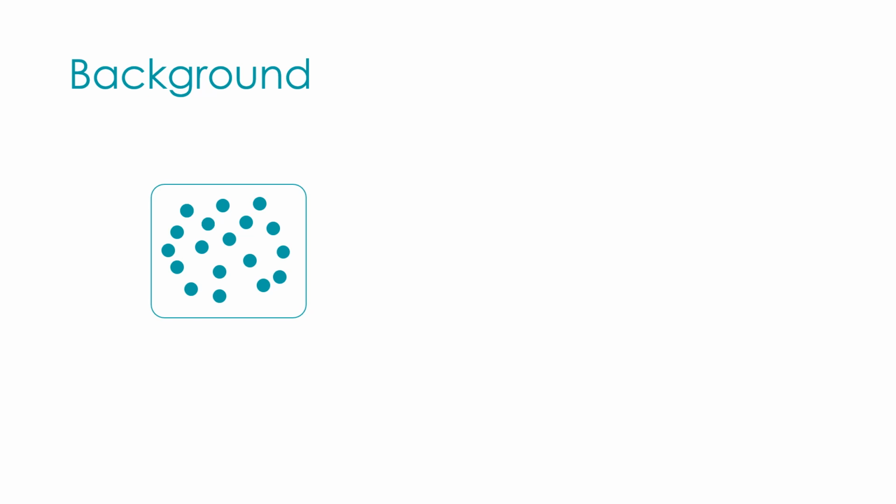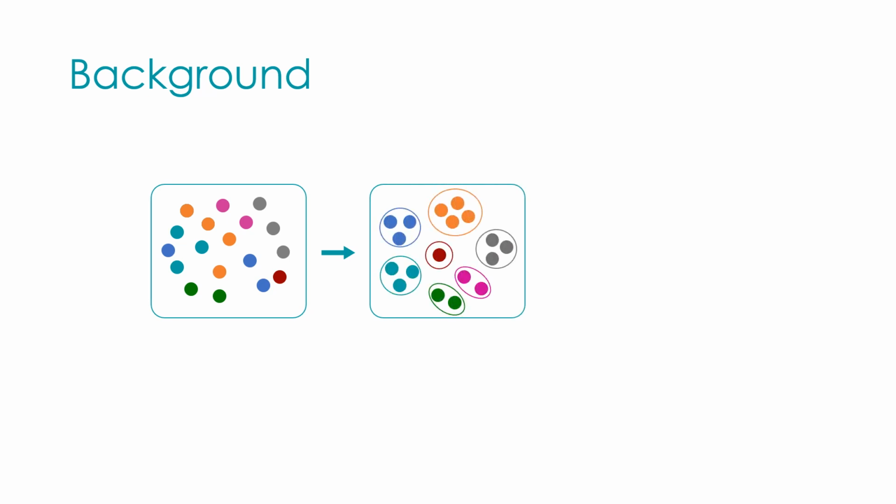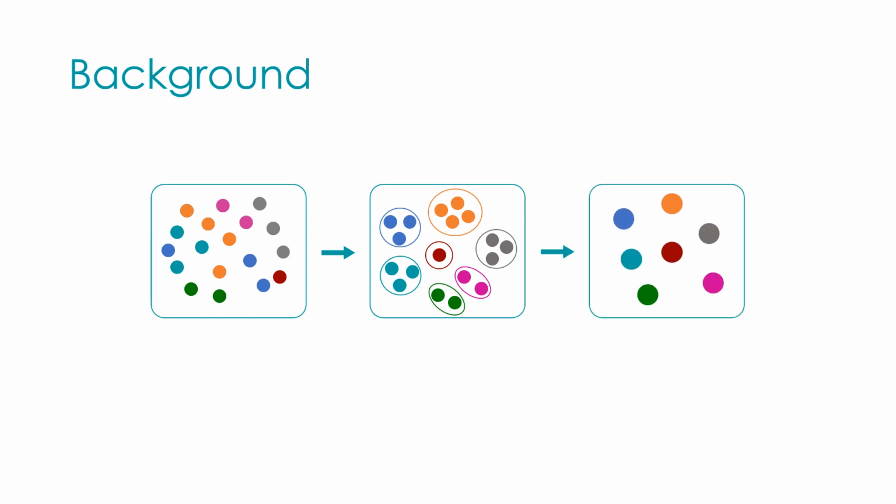Consider this as a small collection of chemical compounds. Now, if we find the scaffolds of each of these molecules, we can easily identify that multiple compounds can have the same scaffold, that is, the same core structure. This idea is the basis of our design because we can simply group the molecules based on the scaffolds. Firstly, this reduces the number of items to deal with, and second, it gives a better overview and organization of the space. Now we treat each scaffold as a node in the network.